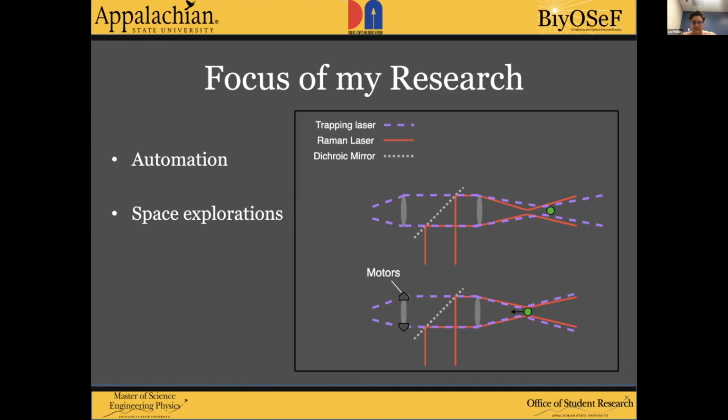An automated LTRS system has broad applicability to the research and development of uncrewed space missions. It's overall a safer option that can greatly reduce human contamination and overall allow for analysis to be done without the transporting of the sample back to Earth. And overall, it's a real asset to future space exploration.